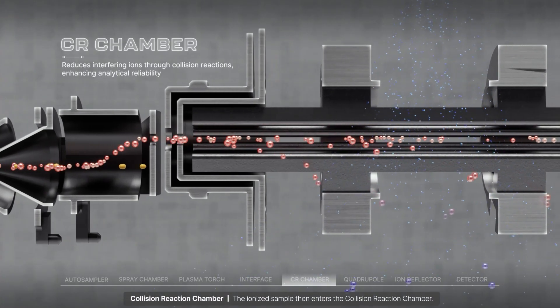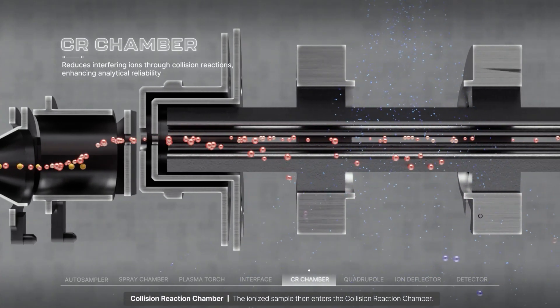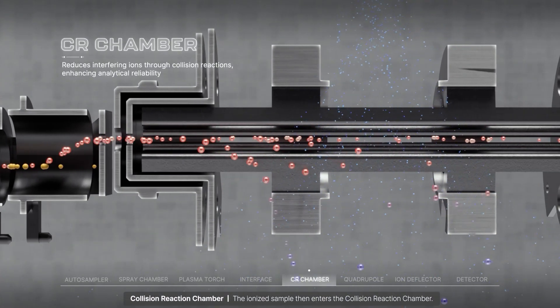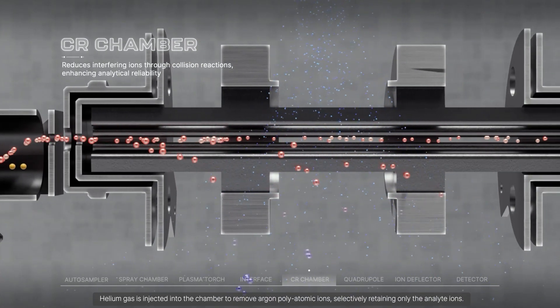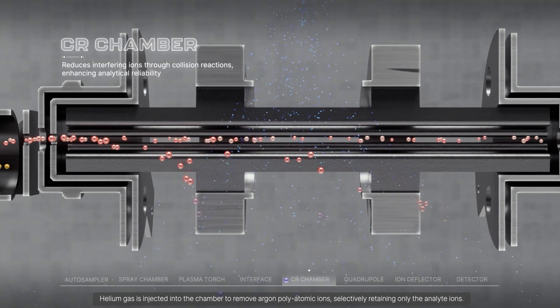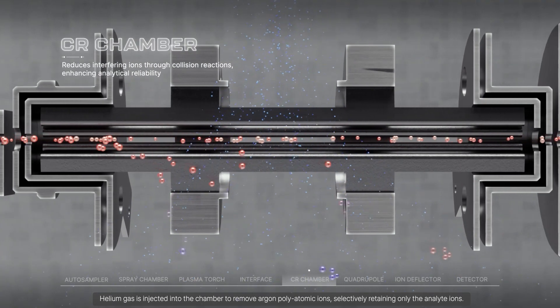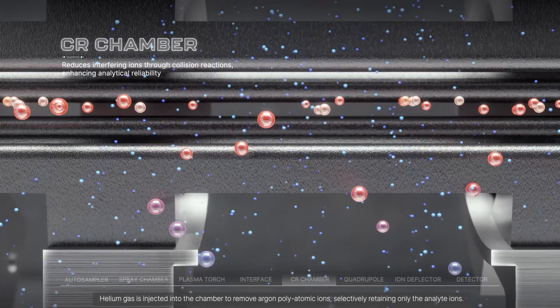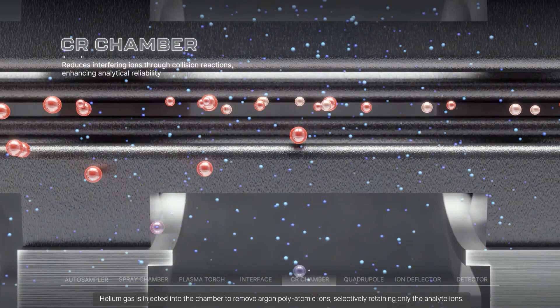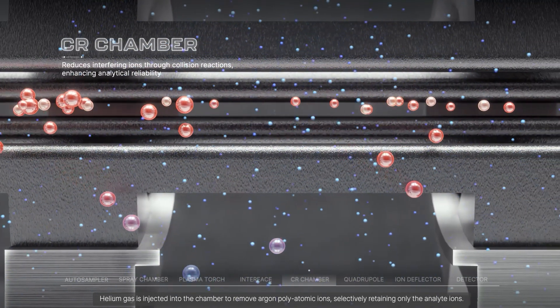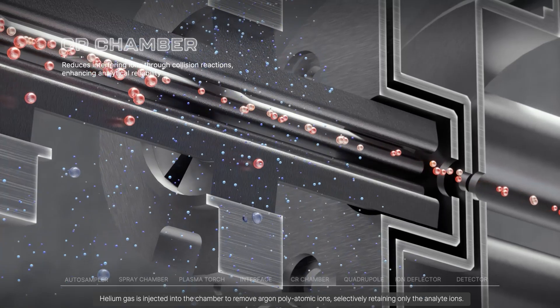The ionized sample then enters the collision reaction chamber. Helium gas is injected into the chamber to remove argon polyatomic ions, selectively retaining only the analyte ions.